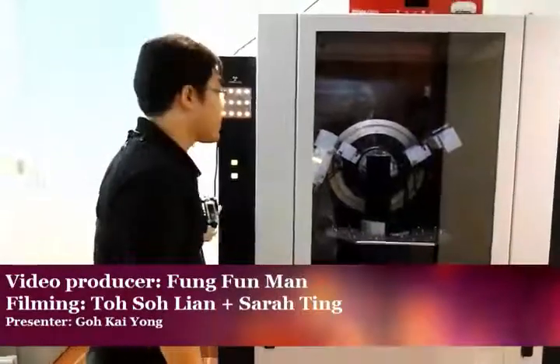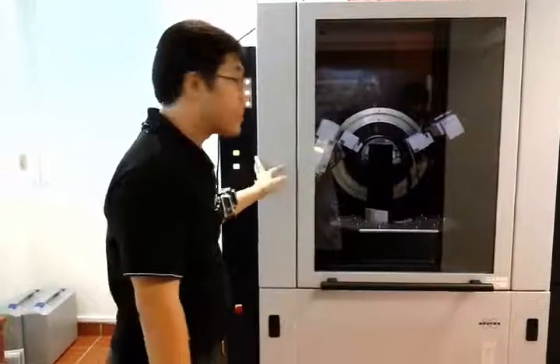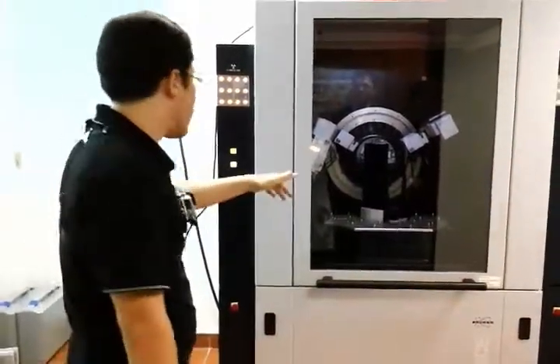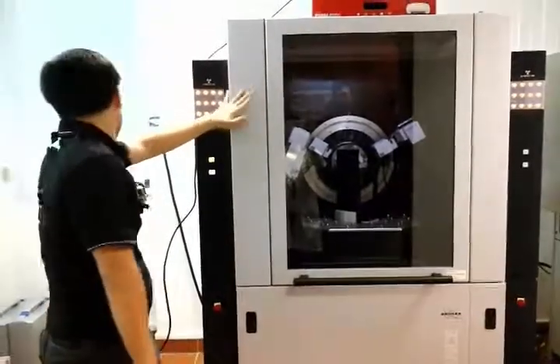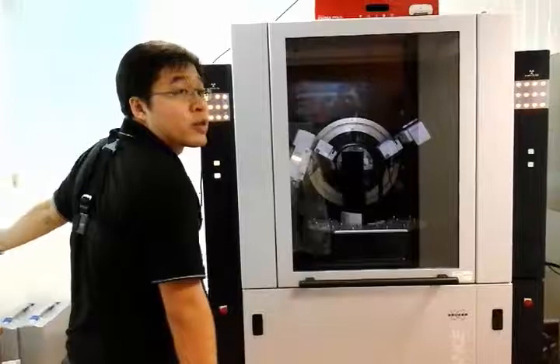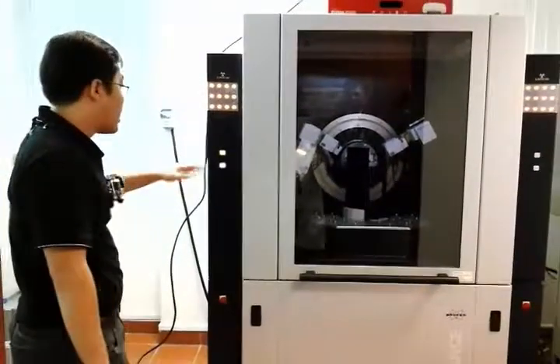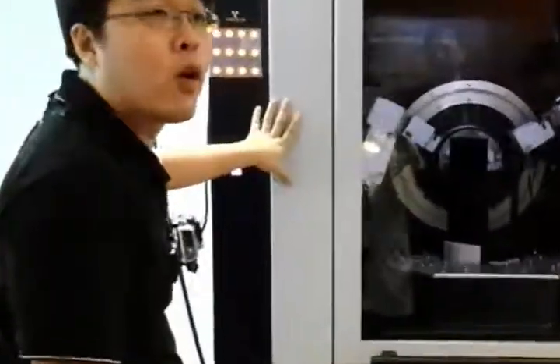Hi everyone, I'm Kai Yong, the service engineer for this D8 Advanced system. This morning I'm going to introduce you to the hardware for the system first, then for the later part I'm going to touch on the software side. Firstly, I will touch on the buttons and what they are for.